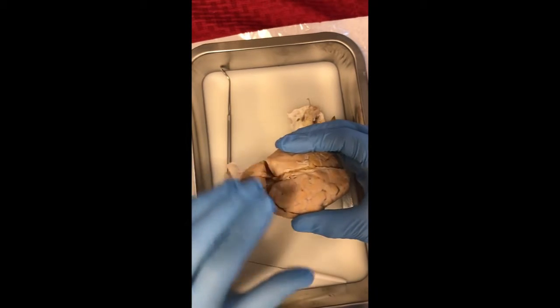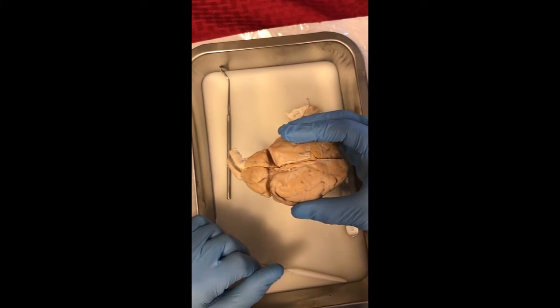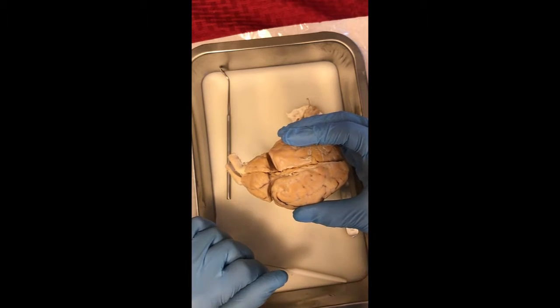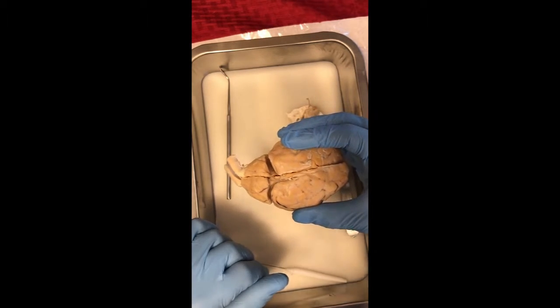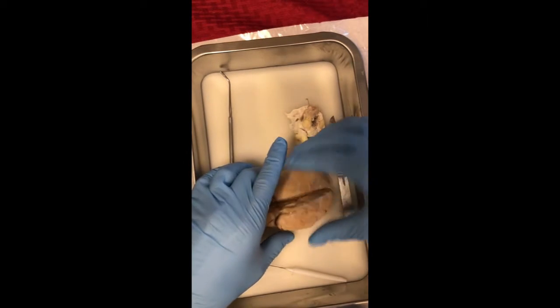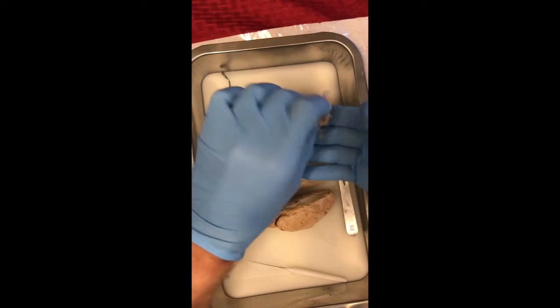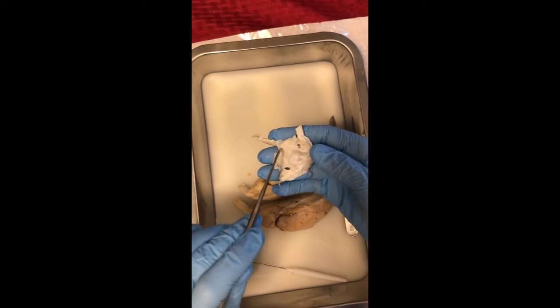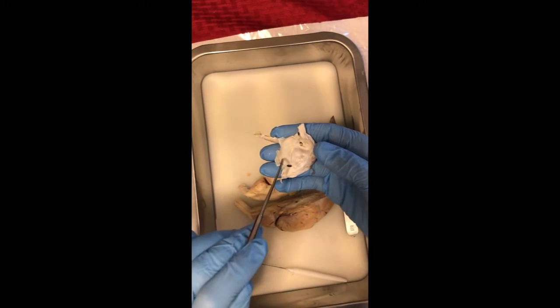Next is the meninges. These are the coverings of the brain. So there are three: the dura mater, the arachnoid, and the pia mater. The dura mater is the thick outermost layer. This came off, but it looks kind of like fat or gristle on a steak.